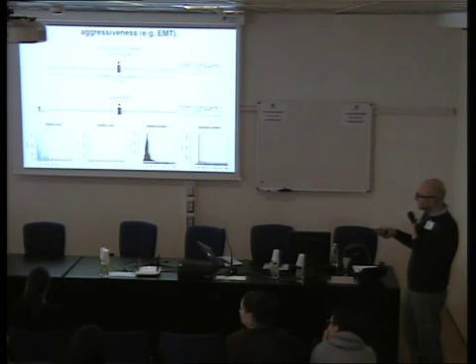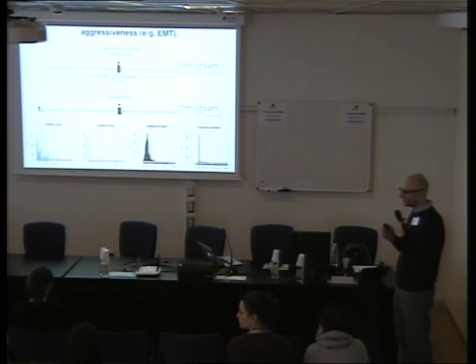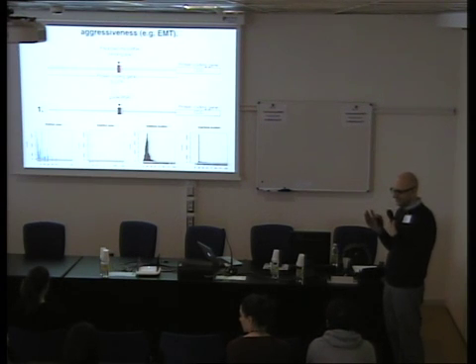So you can see that you have quite big deletions with one guide RNA, in that region, and the sizes differ because the non-homologous end joining is error prone. The deletions are different in size. So it's quite random, the mistake that you generate.